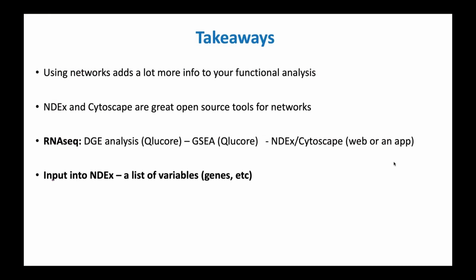And so in terms of the workflow, RNA-seq, and in terms of what you can do in Qlucore, differential gene expression and visualizations can be done in Qlucore. Then we have integrated GSEA, or you can use your other tool of preference for pathways.